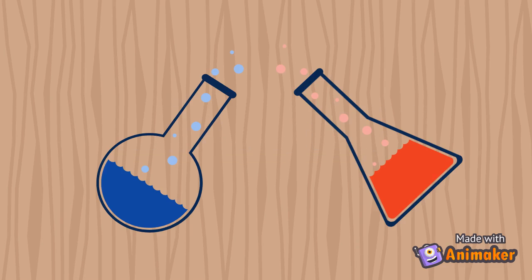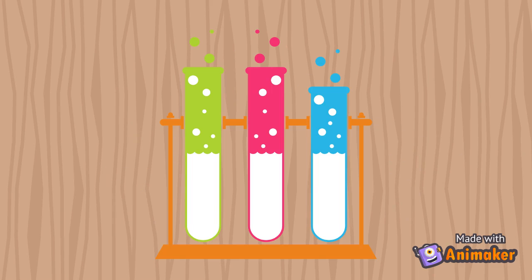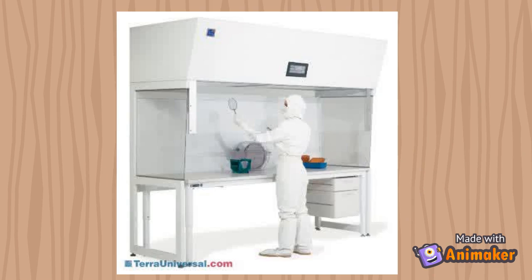Handling bottles and flasks. Do not keep the open bottle vertically. Keep it at an angle as shallow as possible, as long as spillage does not occur. A test tube rack can avoid the risk of spilling the sample culture. In laminar flow, avoid letting your hand or any item come between an open culture bottle and sterile materials.